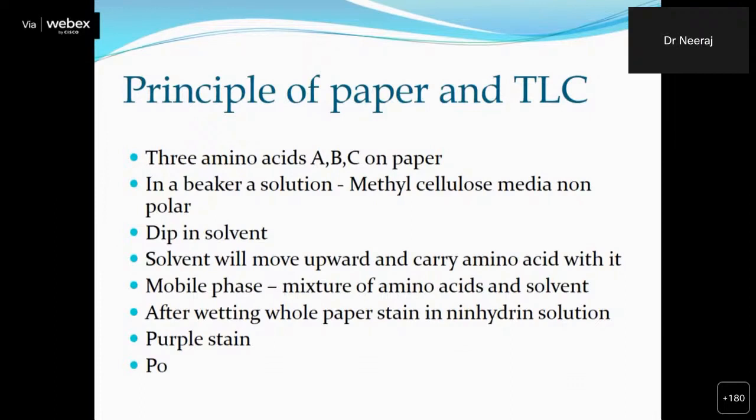So in this case the mobile phase is a mixture of amino acids with the solvent, because the amino acids are moving as well as the solvent. After the whole paper becomes wet, we take out the paper and stain it with ninhydrin solution. It produces a purple stain, particularly with amino acids. Then we see the location of amino acids A, B, C on that paper.